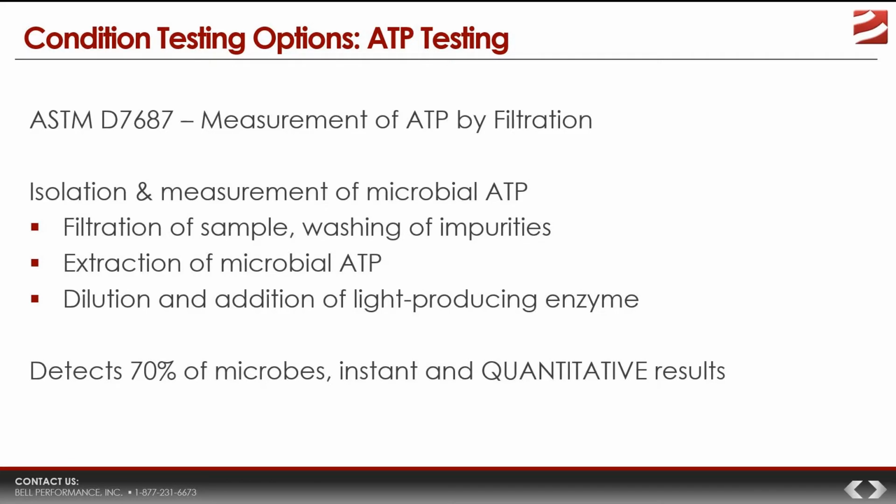Then you take a little bit of this special enzyme. One trade name from LuminUltra is called Luminase. You add this enzyme to it and mix it up. What the enzyme does is that when you expose that mixture to UV light, it causes the ATP to glow, to produce light, essentially.